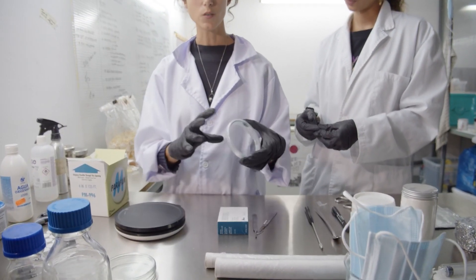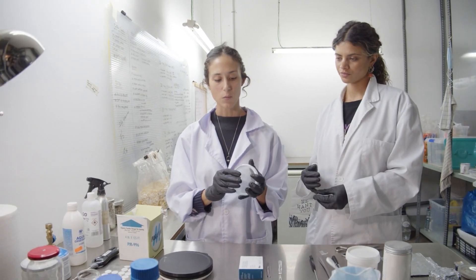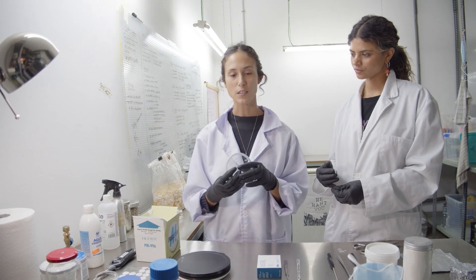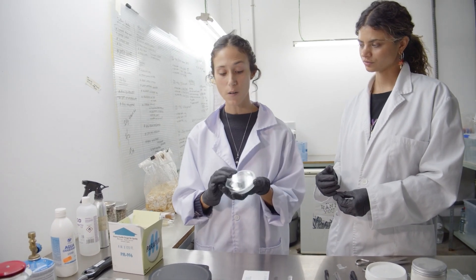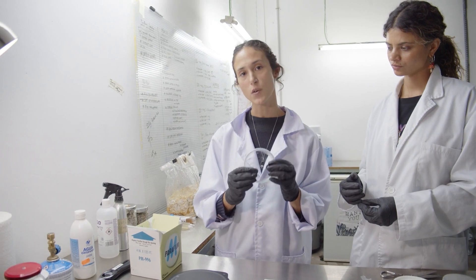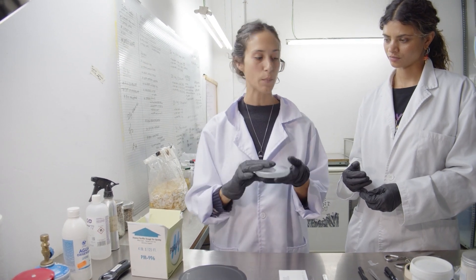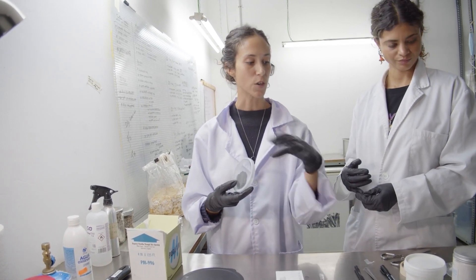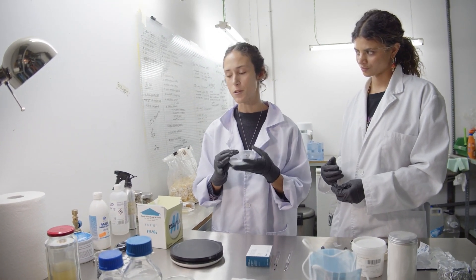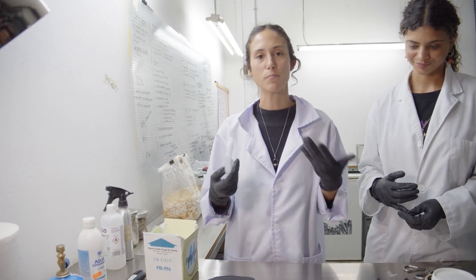We do use a lot of plastics and things that aren't necessarily sustainable. To keep the most sustainable practices, reuse your gloves and mask as many times as possible, have a washable lab coat, and choose glass petri dishes instead of single-use disposable ones. Some things you can't avoid, but if you get good at this practice you might not even need parafilm — though sealing plates with aluminium foil is also not recyclable.